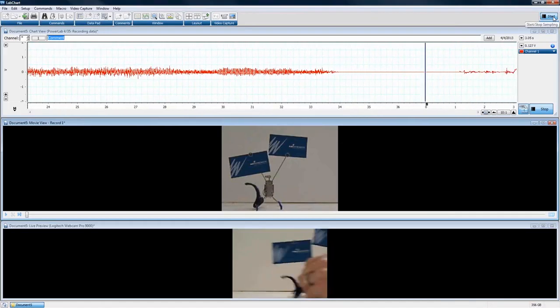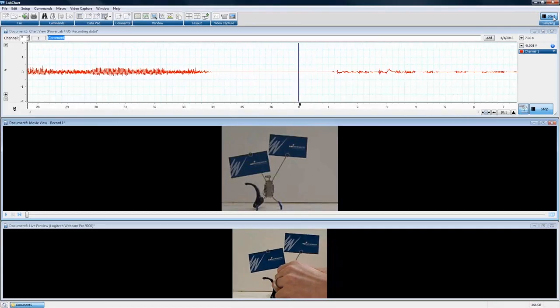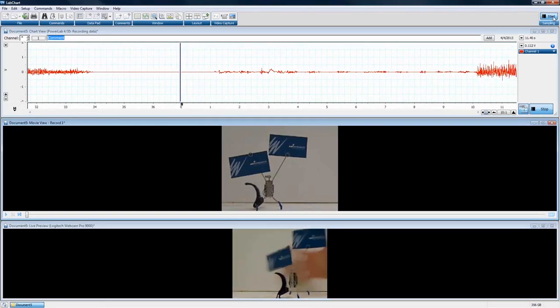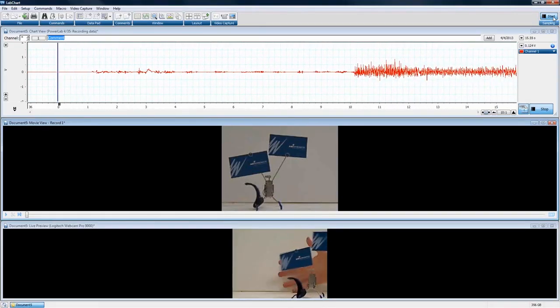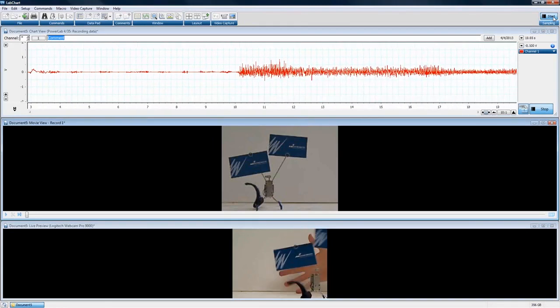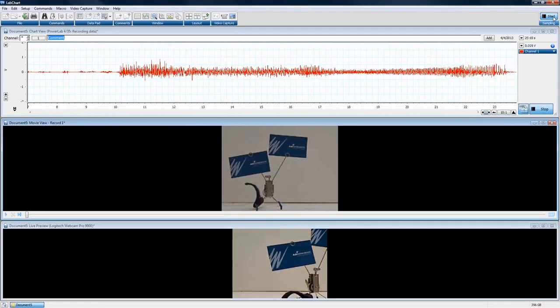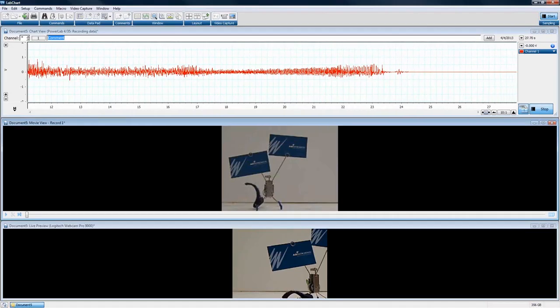Do a little wind up here. You can see down there in the live preview. And just so we have something different from our last video, I'm going to have my hand behind there. Okay. We'll close the live preview and stop recording.